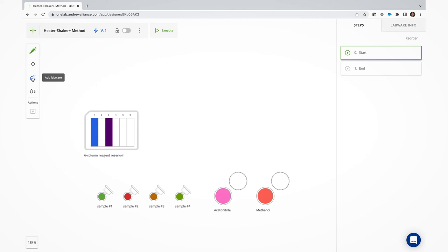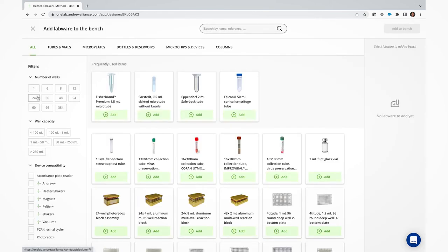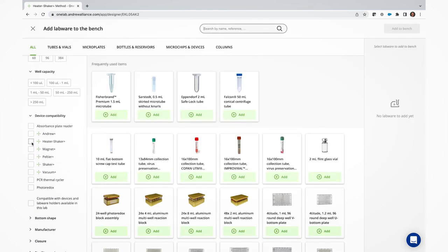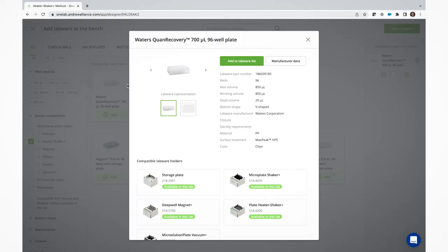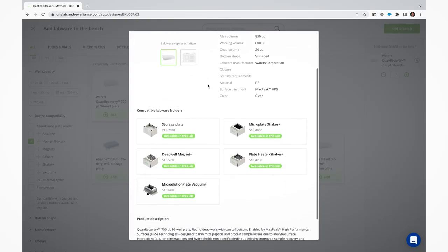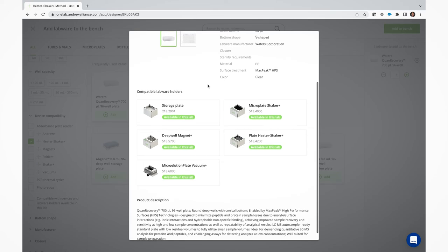Let me show you how to create a protocol step that will utilize a Heater Shaker Plus device. Once in the protocol designer window of OneLab, it's important to first select Heater Shaker Plus compatible labware. This can be done by simply ticking the Heater Shaker Plus compatibility filter on the left of the labware selection window. Any consumable chosen from this filtered list will then trigger the use of the device during the execution phase.